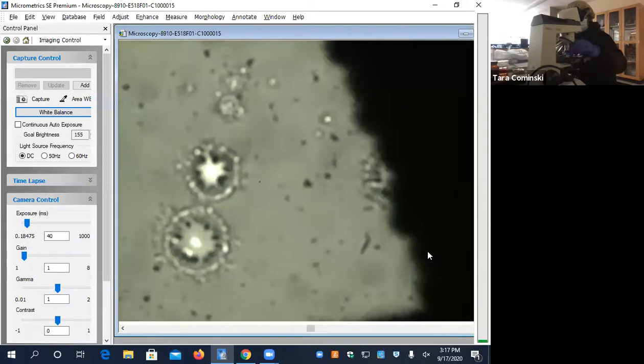And then you're going to get it in focus under scanning first. Here's your onion. All right, and then some drops of the iodine, cover slip on top. Those little cover slips in that box go on top after you put your iodine. So put enough so that you feel like it changes color slightly. Yeah, I think that's enough.